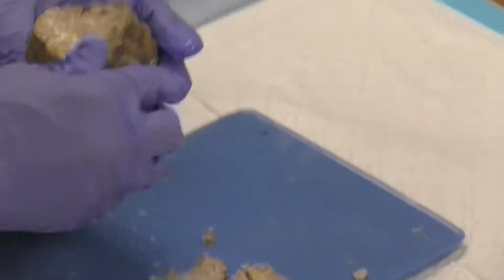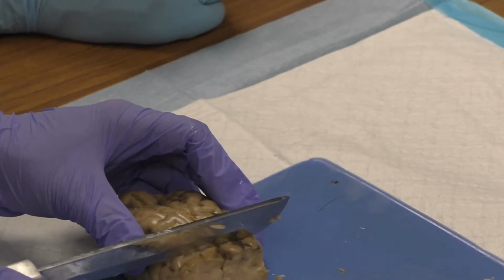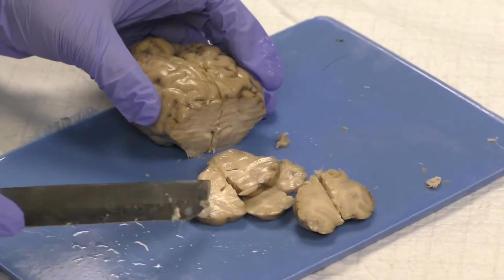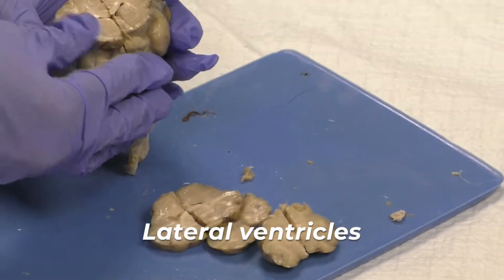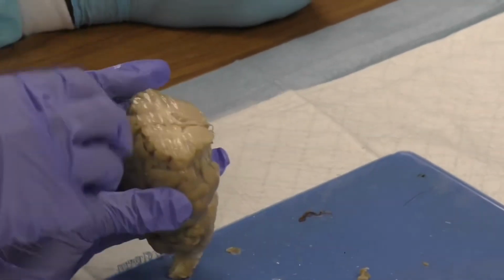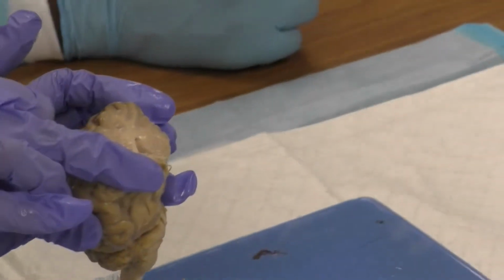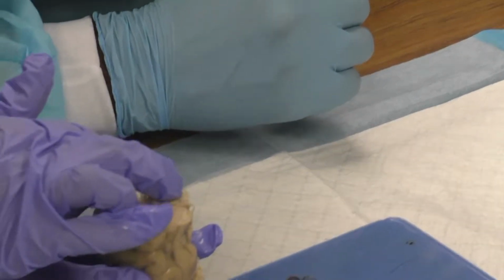And you can see it. Okay. And what I'm looking for is the start of the lateral ventricles. Oh, there they are. That little hole there is the start of the lateral ventricles. Can you see that? So, and then what is this big ball here that's making up the lateral wall of the lateral ventricle? See that wall?